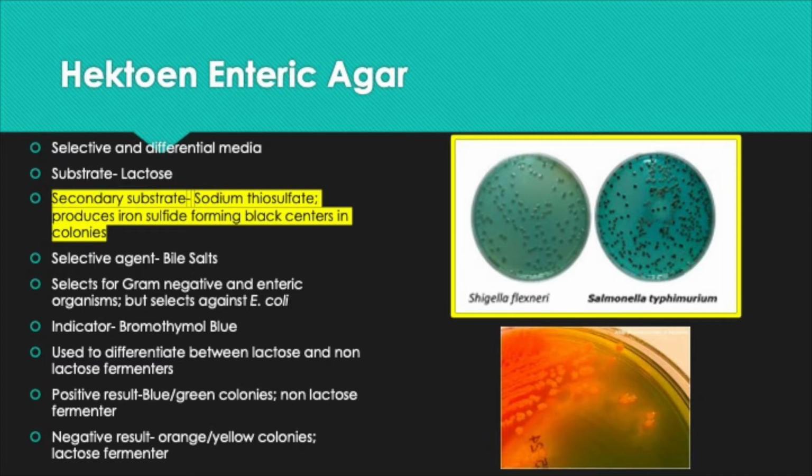So the reason why we do this, Salmonella, of course, produces blue-green colonies. It grows, produces blue-green colonies, but it gives us black centers to the blue-green colonies. So that would be indicative of Salmonella. Shigella, on the other hand, which is a completely different type of bacteria, gives us blue-green colonies, but does not have black centers. Okay? And so, of course, Salmonella comes from chicken.